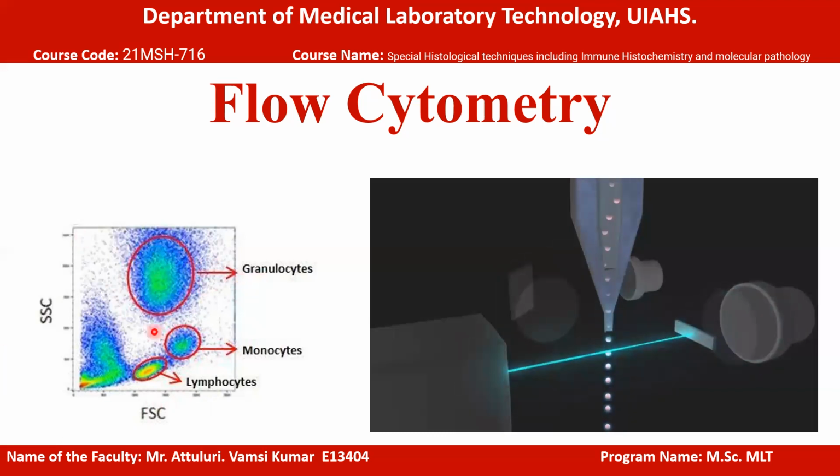So this is called gating in flow cytometer. Now, even within a granulocyte, we can further differentiate whether it's a neutrophil, basophil, or eosinophil. Even in a neutrophil, we can further differentiate the type of antigen we want within the cell, by labeling them with some fluorescein dyes, that I will discuss in tomorrow's lecture.